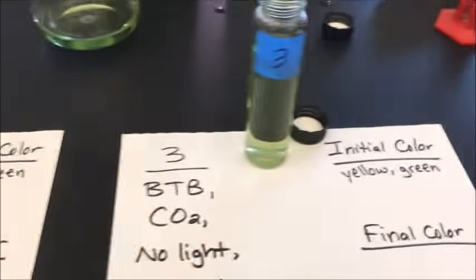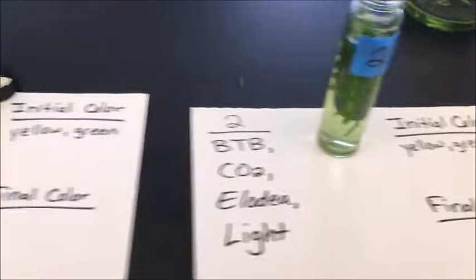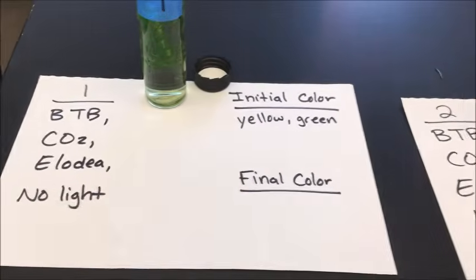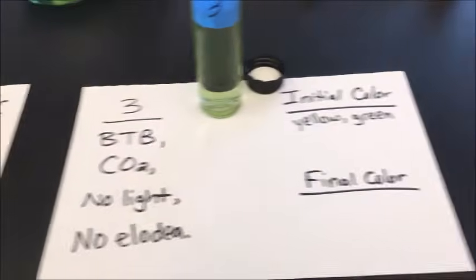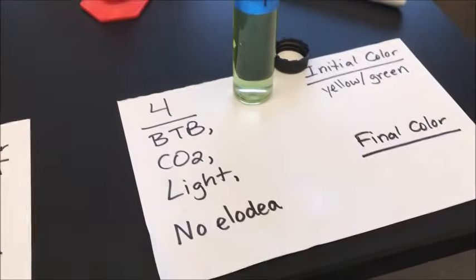So I'm going to go ahead and put the caps on, and the ones that are going to be in darkness, I'm going to store them in a cabinet, and the ones that are going to be in sunlight, I'll show you them in a moment.